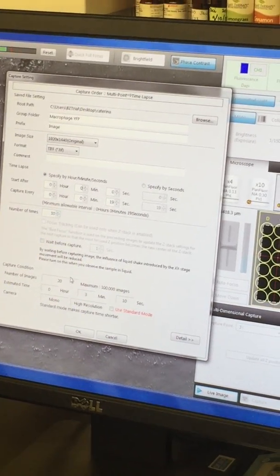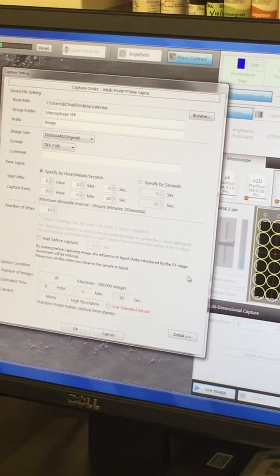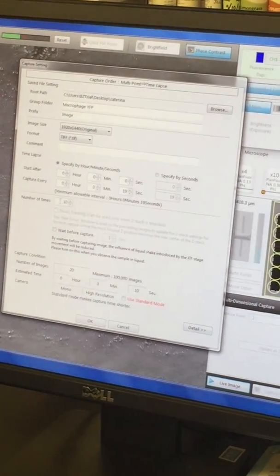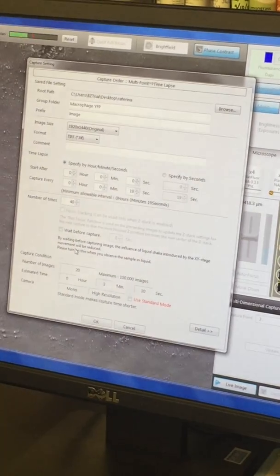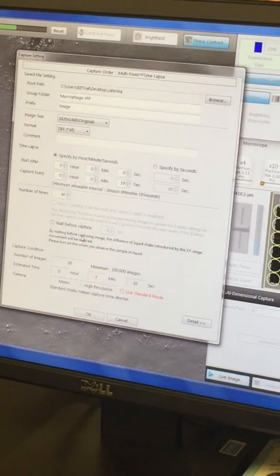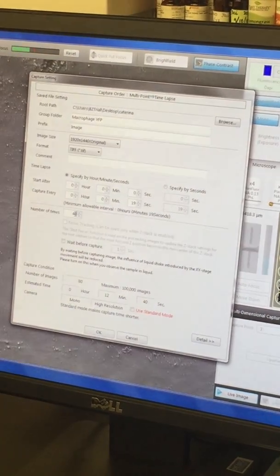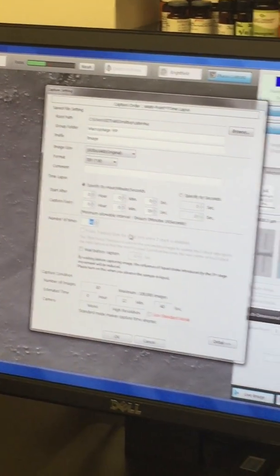So basically, let's say I know that these wounds won't heal in under 5 hours, right? So I'm going to want to bump this up. So if I do 40, it switches to 12 minutes. All right, well, now we're way off, so I'm going to have to run this every so often.